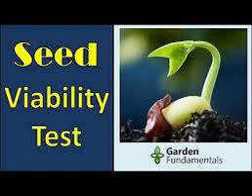Day count: 1, 2, 3, 4, 5, 6, 7. Number of seedlings emerged, lot A: 0, 0, 0, 4, 3, 20, 0. Number of seedlings emerged, lot B: 0, 0, 15, 50, 25, 0.